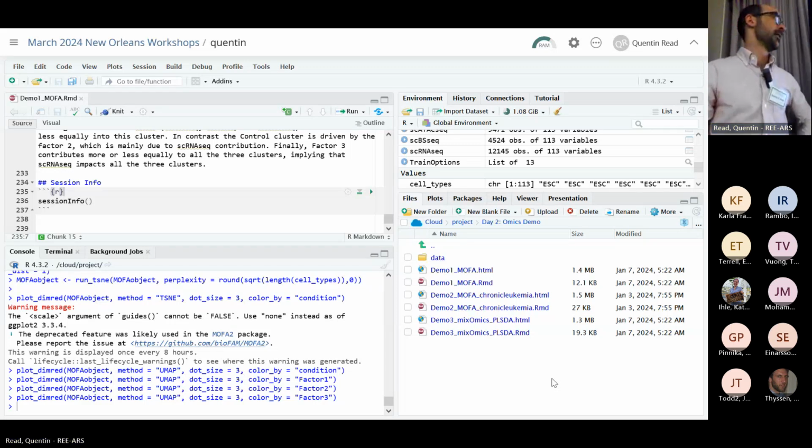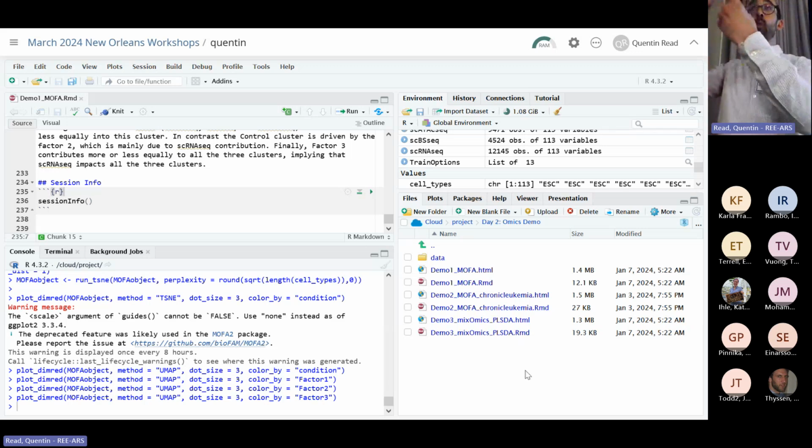And this is partial least squares discriminant analysis. We're only going to be looking at one omic, so it's a little bit simpler in terms of not trying to wrap your head around integrating multiple omics. It's trying to look at one omics data set and how it associates with a disease covariate. That's what we're going to be doing now for the next 45 minutes, and then quit at 12:30.